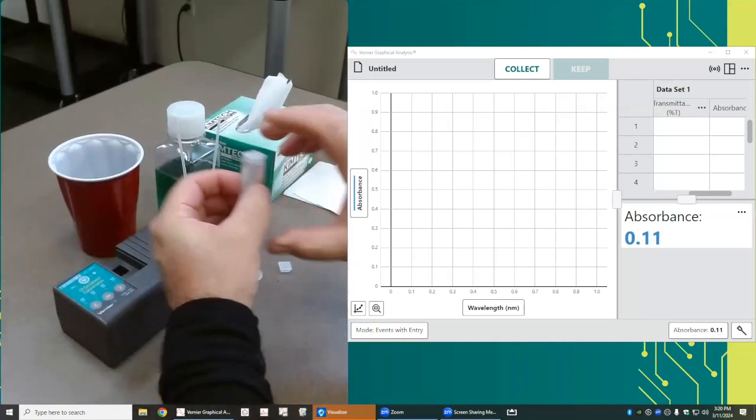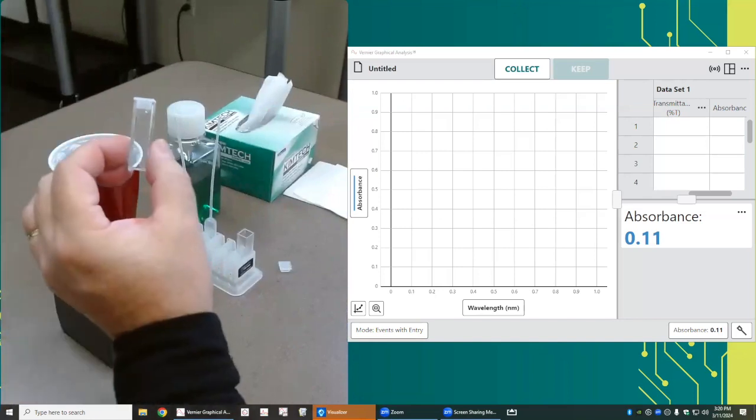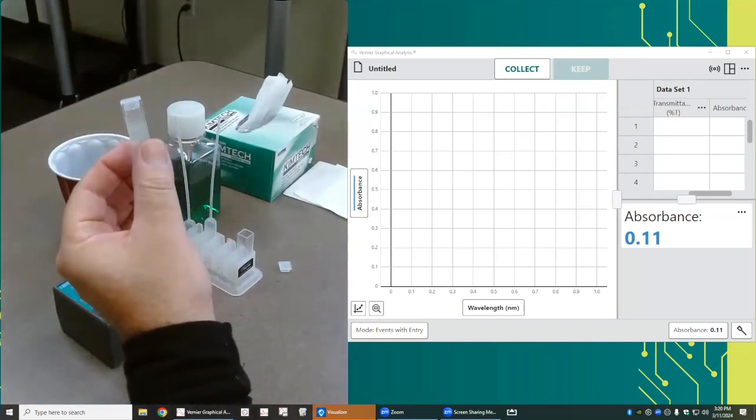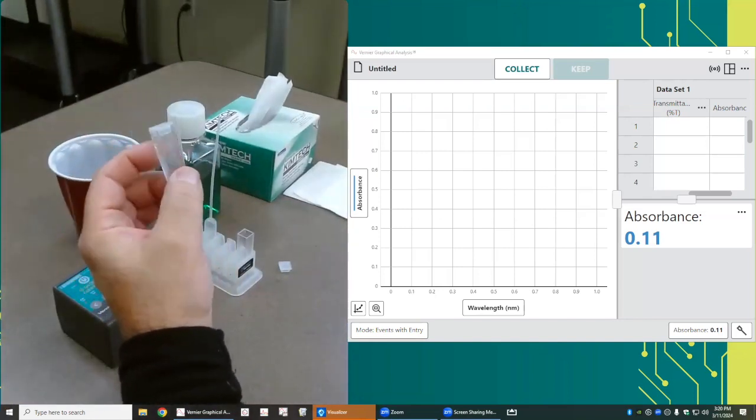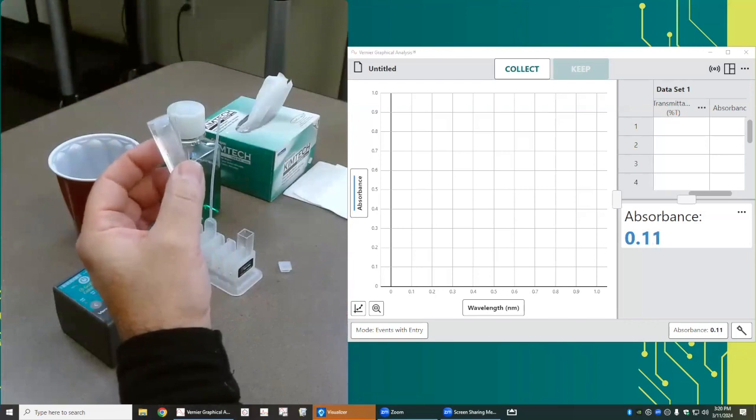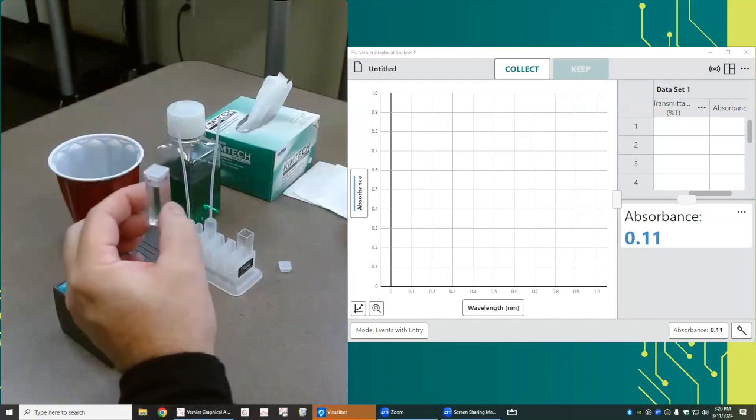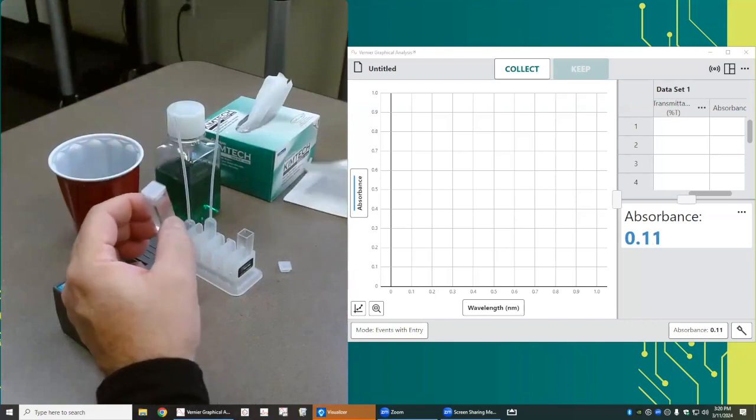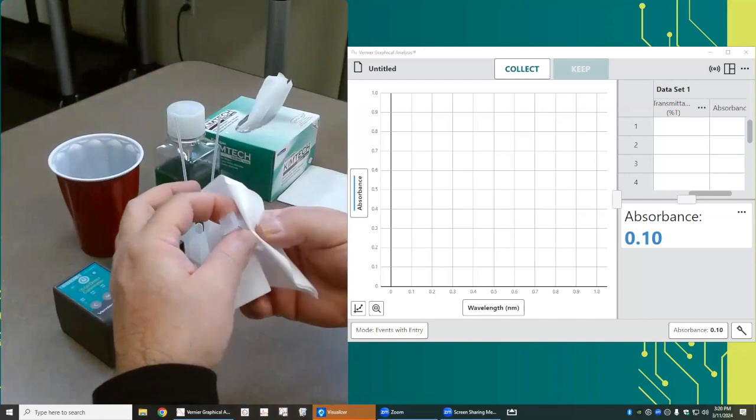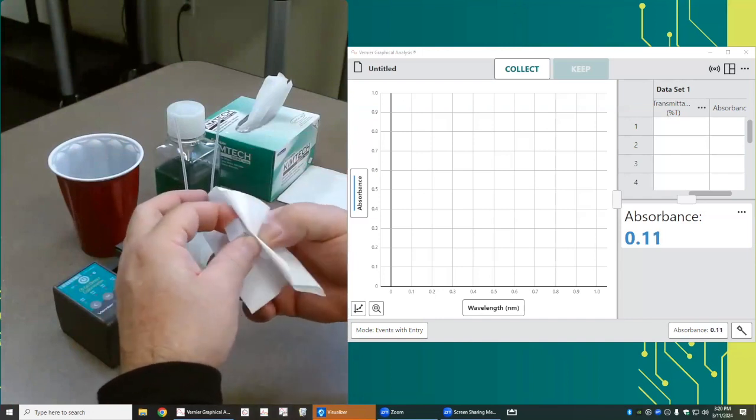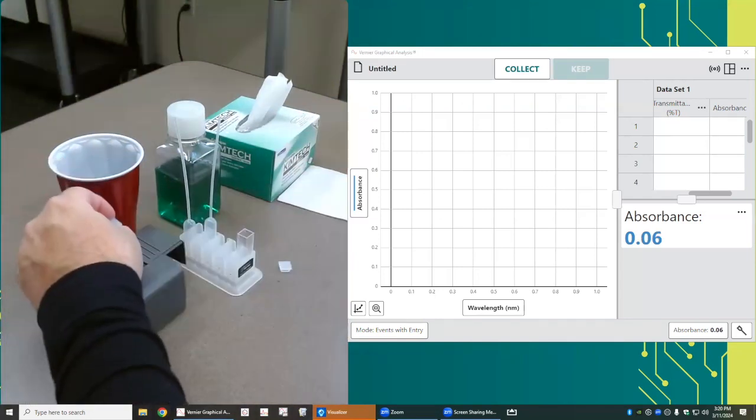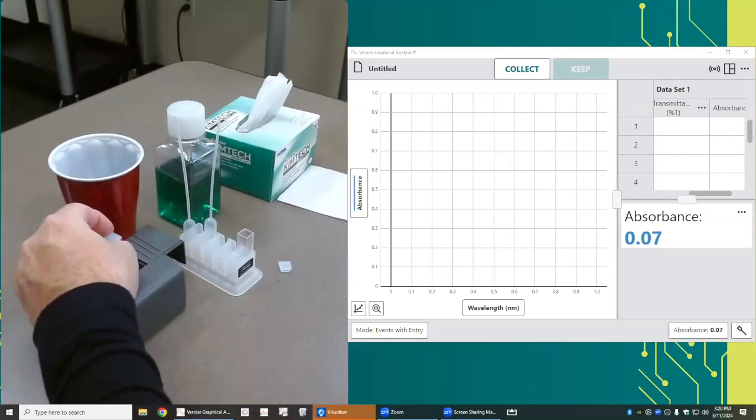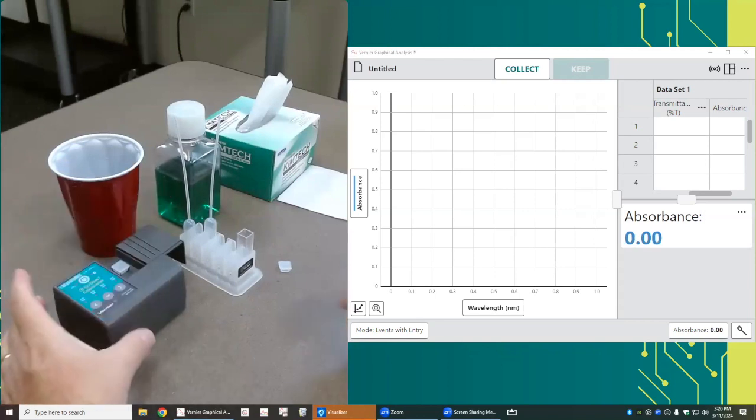The cuvette has two sides that are clear and two sides that are fluted. The fluted sides are for you to hold, the clear sides are the sides through which the light should pass. I'm going to make sure that they're nice and clean. So I want to line that up so that the clear sides are going to be where the light is passing.